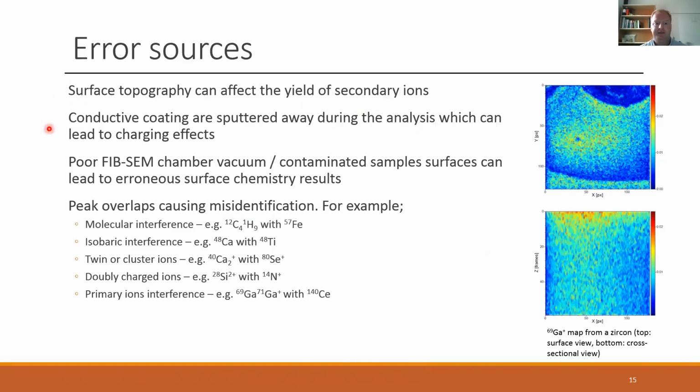Ideally, you get the best results on conductive materials, although we often work with insulating materials. When you can use the electron beam to charge compensate, it's a matter of matching the electrons supplied by the SEM with the electrons removed by the gallium FIB. It's quite a neat application that you can charge compensate using not a flood gun, but just the electron beam already in the chamber.